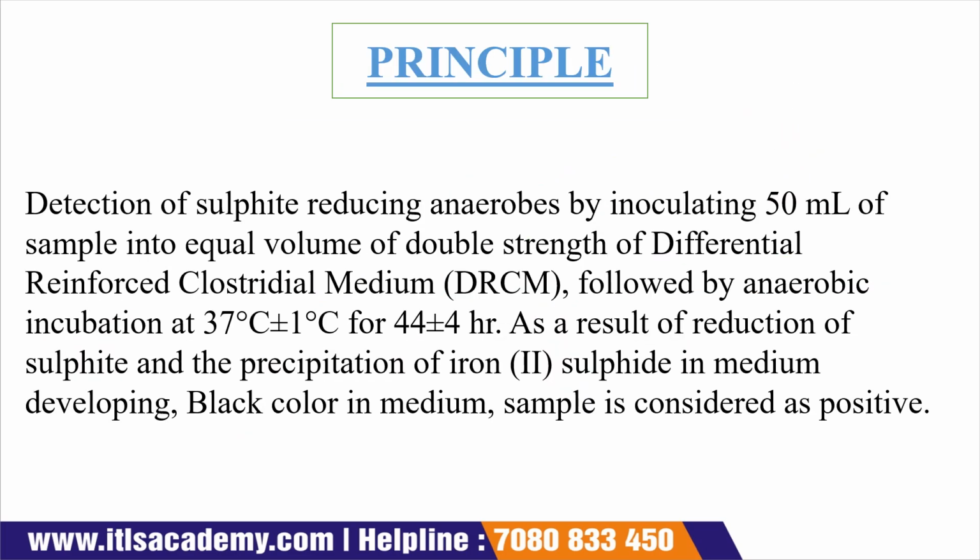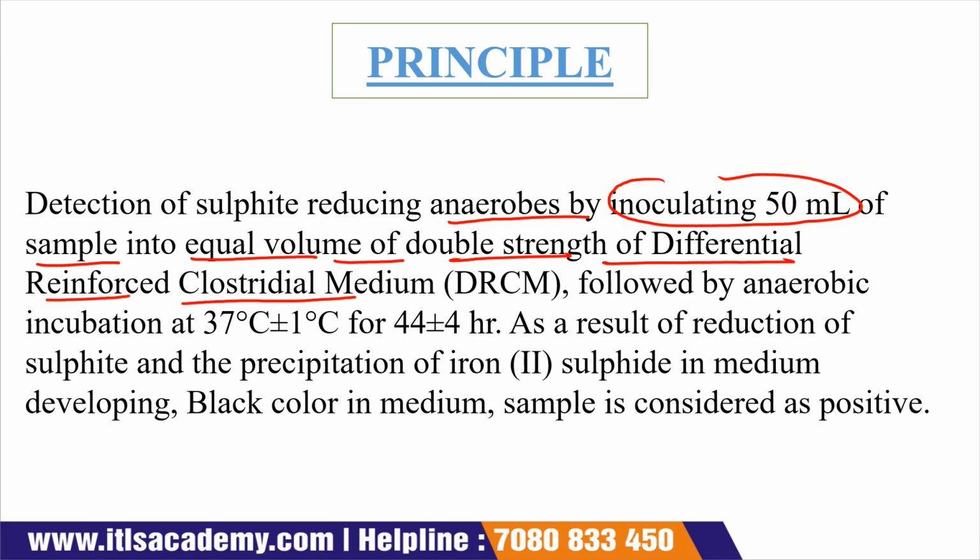Principle. Detection of the sulfite reducing anaerobe by inoculating 50 ml of sample into an equal volume of double strength differential reinforced Clostridium medium.